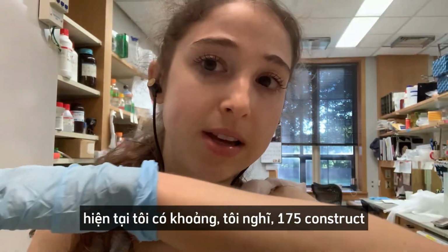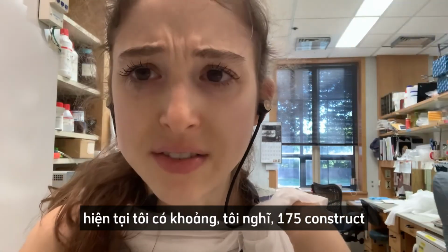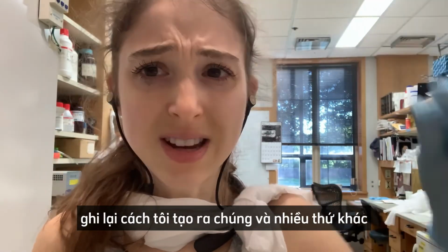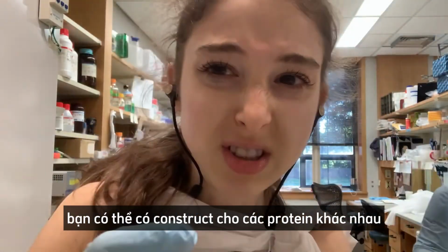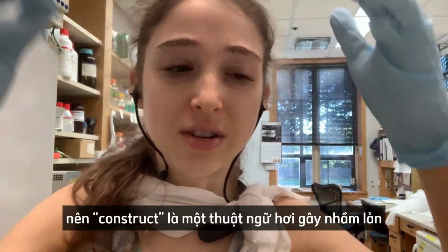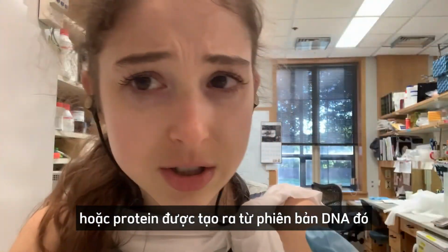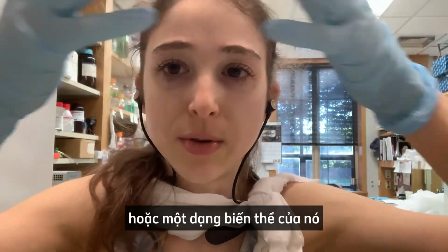And so I have 175 constructs now. I have them in a whole spreadsheet with how I made them and all sorts of stuff. The reason you have so many constructs is you can have constructs for different proteins and then different versions of those proteins. Construct is kind of a confusing term because we can use it to refer to the DNA version that we make or the protein that's made from that DNA version. But basically it's some sort of edited version of the protein.